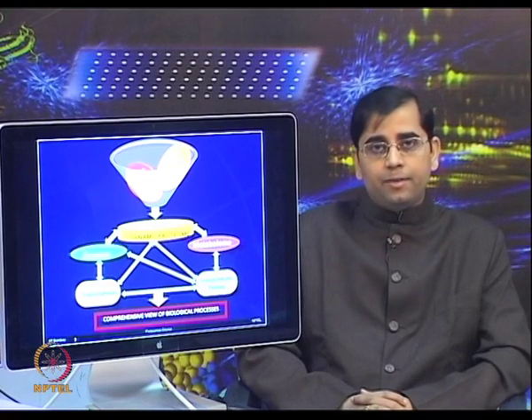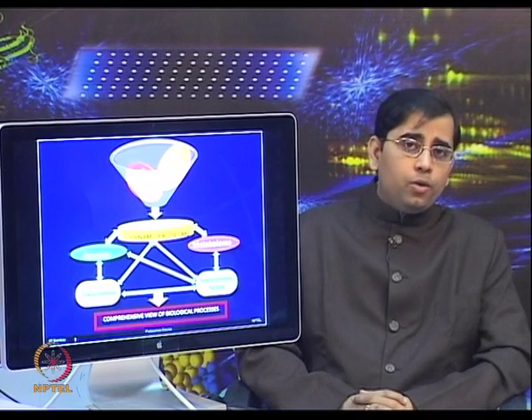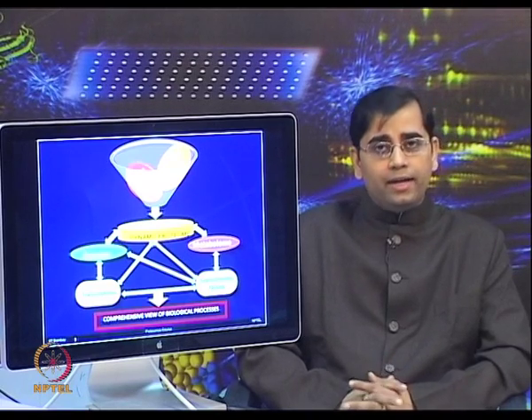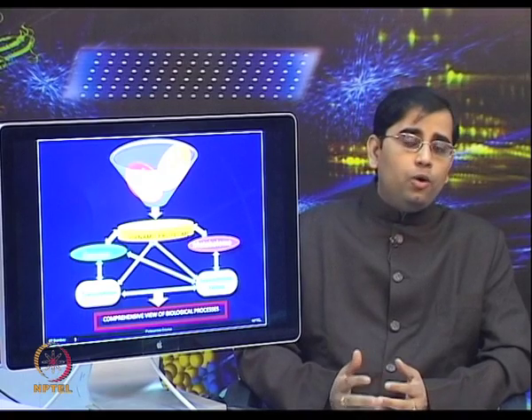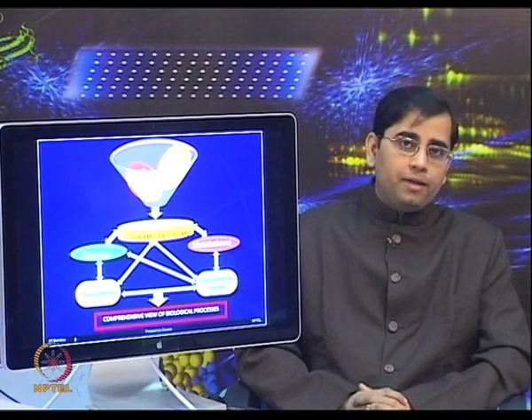We need to study these proteins at the high throughput level, so that not only do we study a given protein in context, but we also know how that protein interacts in that biological system. So, to answer many of these questions, the protein microarray platform as well as some other high throughput proteomic techniques have been generated and shown potential for high throughput applications.